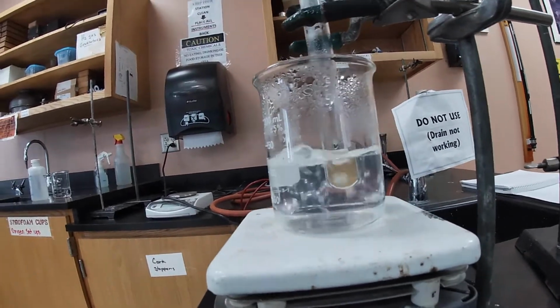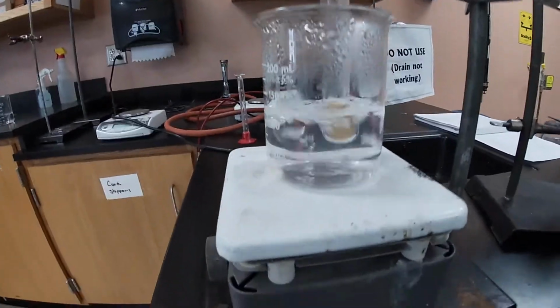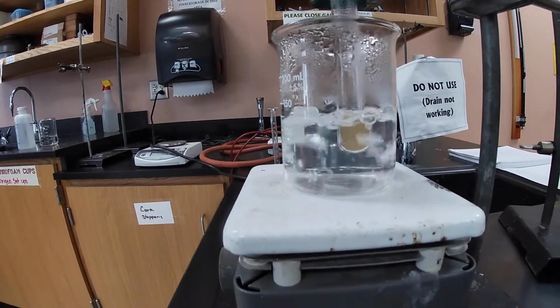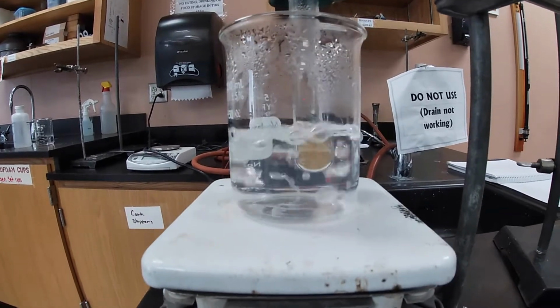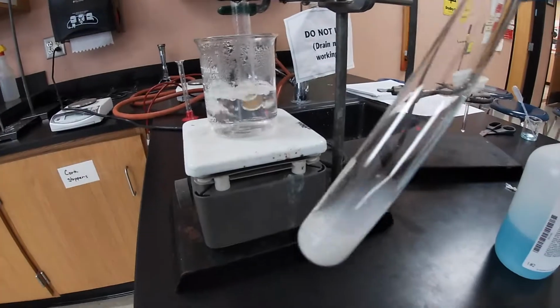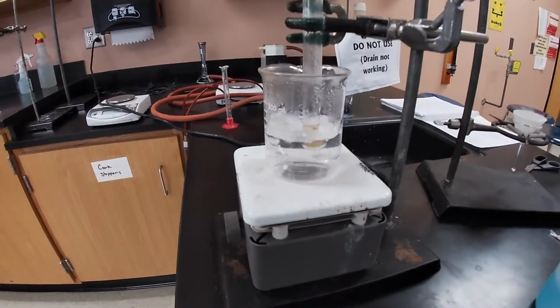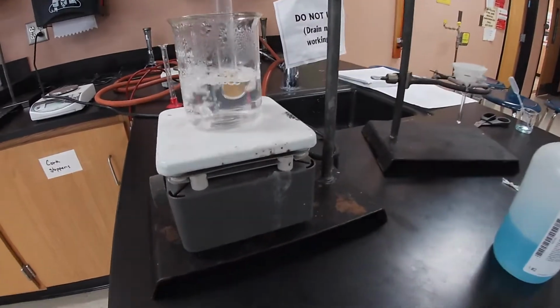As we go back, we will see that the filtrate that was left over once we went through the filter paper contained some glucose, and of course, as we said, our precipitate from the sodium chloride, our chloride ion precipitate. And if you look at the starch, there was no starch left in that filtrate.